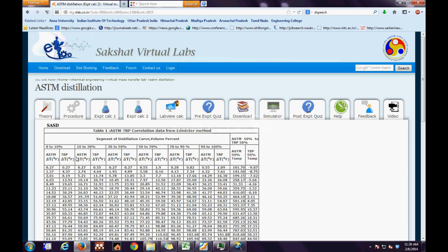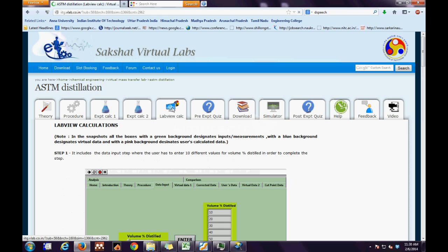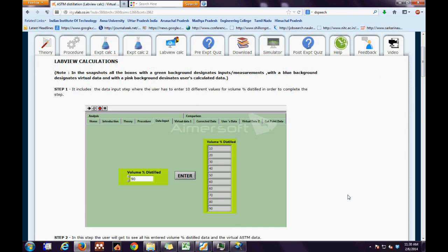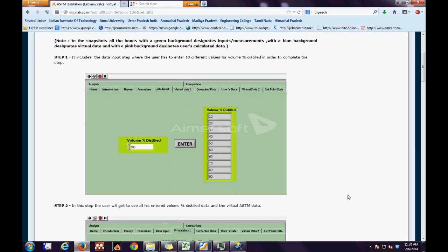Experimental calculation part 1 has been done from data obtained from these charts. Next comes the lab-way calculation part. In the lab-way calculation part, we have snapshots of the virtual experiment.